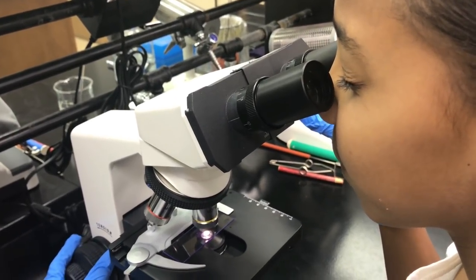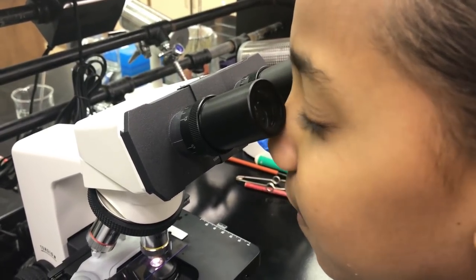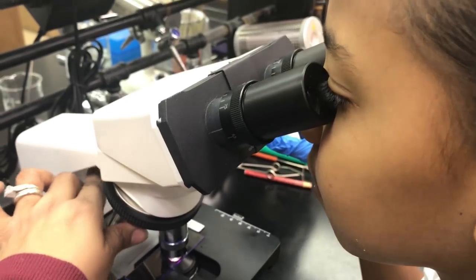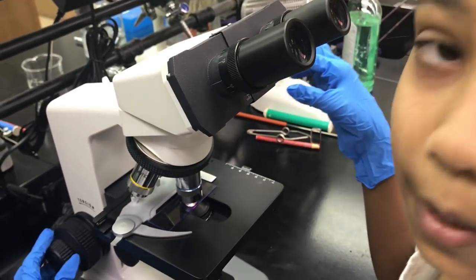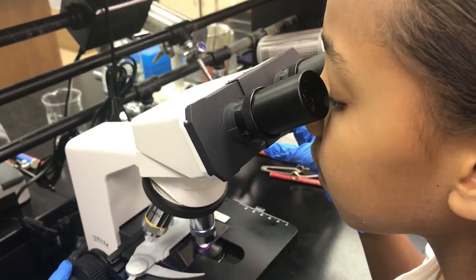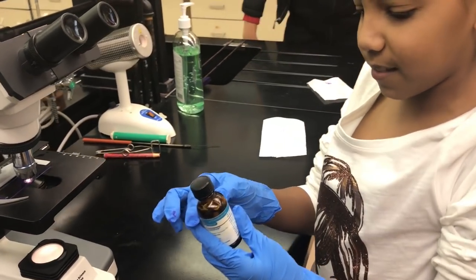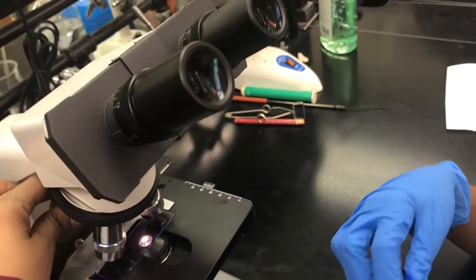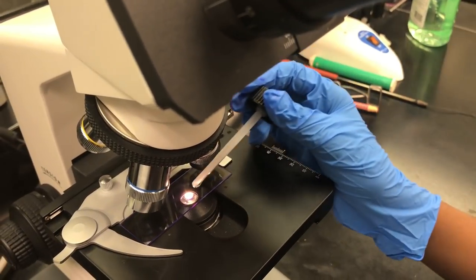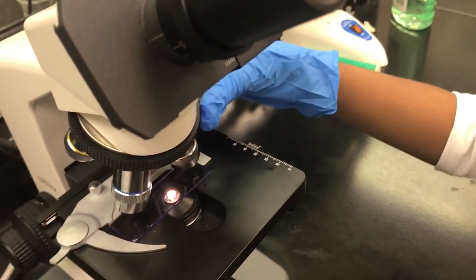Big? Small? There's a lot. Okay, so you've got it focused? Right now we have to change objectives to the high power. I'm going to be using oil immersion so it's super, super big. Just drop the oil right on the slide. Don't flood it, just a drop. And then you put it on the total magnification of 1000x.